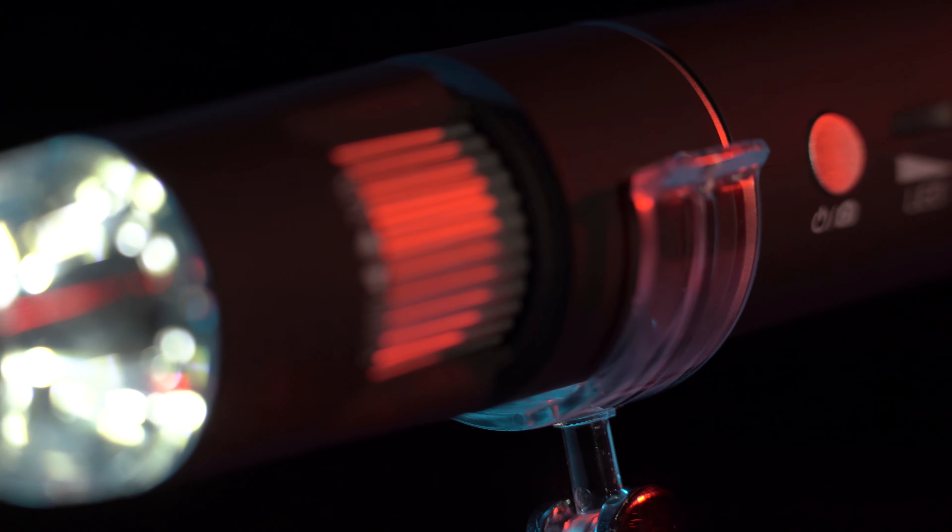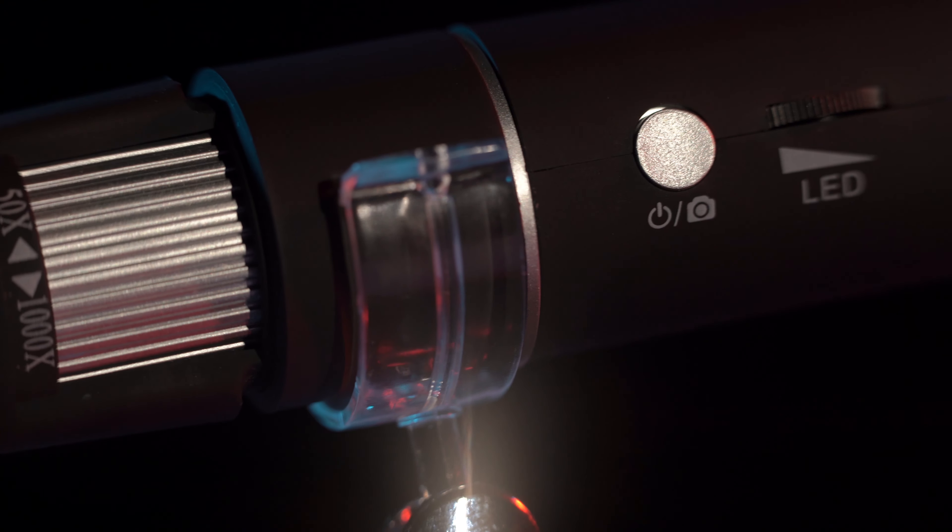This actually works pretty well. It works by Wi-Fi. You can connect it to your phone, and when you're looking on your phone you can actually see what's going on. There is a slight delay, so when you do move it you just need to make sure you pay attention about the delay because you might overshoot what you're looking for.